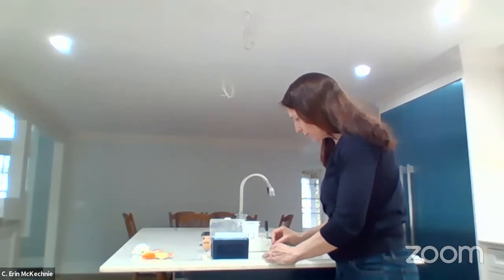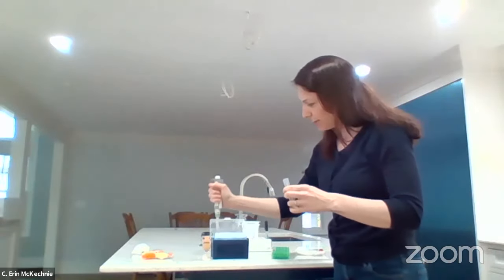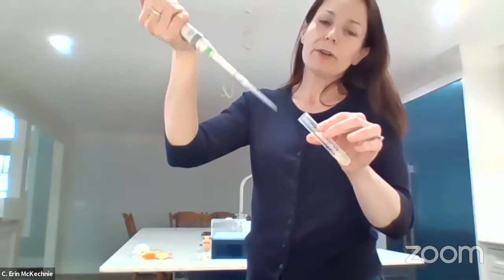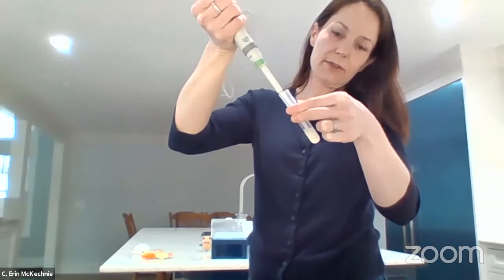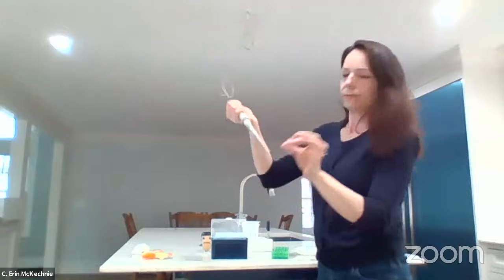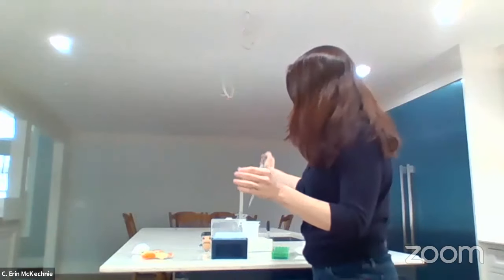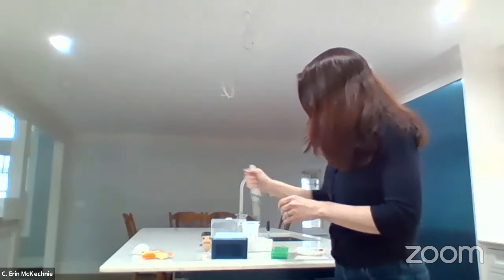So let's pick up one of them. I just happen to pick up this. I'm going to remove the cap. I'm going to use my pipette and get a tip. We'll keep everything sterile. I'm going to go to the first stop, gently place this in the bacterial liquid, and release. I'm going to place it in the tube labeled number 1, and I'm going to change that tip to keep everything nice and sterile, nice and clean. Going to get a new tip.